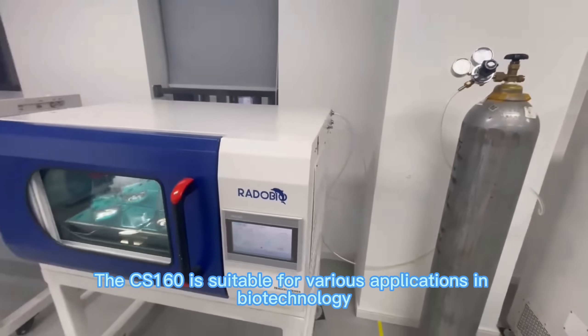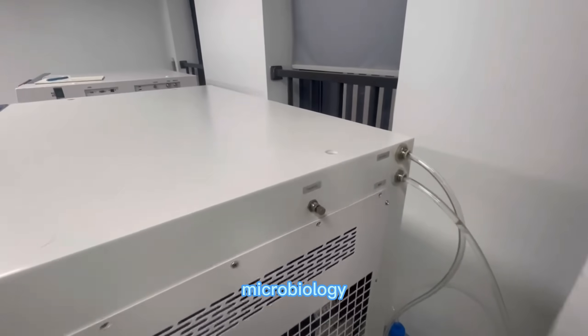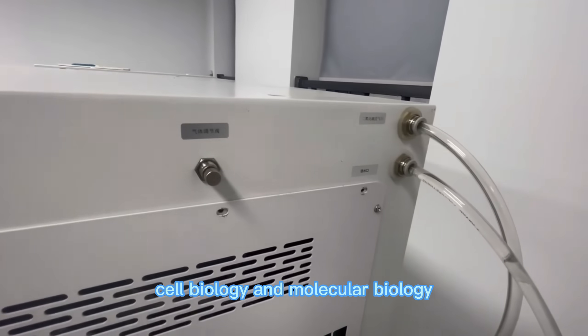The CS160 is suitable for various applications in biotechnology, microbiology, cell biology, and molecular biology.